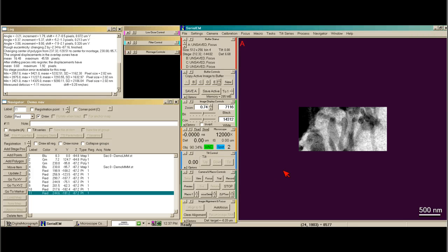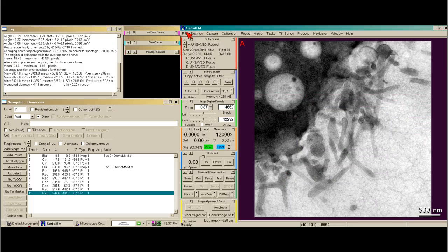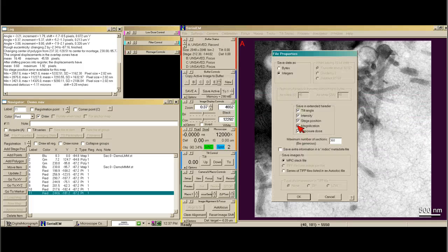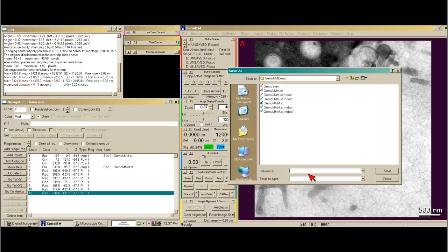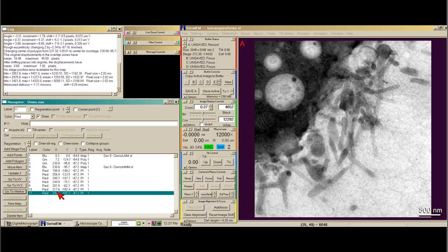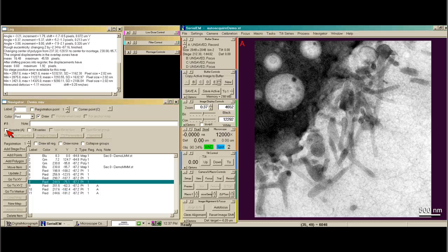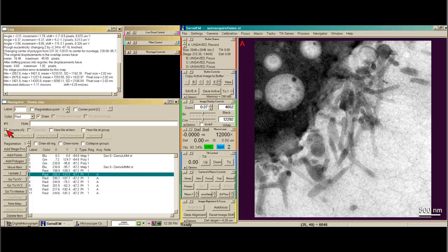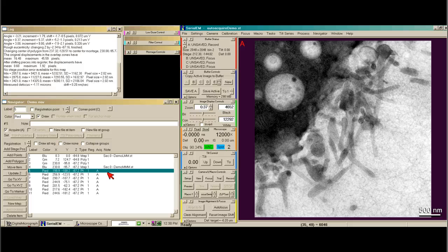Here's my record image. Now we need to open a file — I say 'Open New,' say okay, and I'm going to call this 'autoacquiredemo.st.' We go back to the navigator box and make this an acquire point. You'll see that it adds an 'A' to each position. Now points 5 through 11 are going to be acquire points.